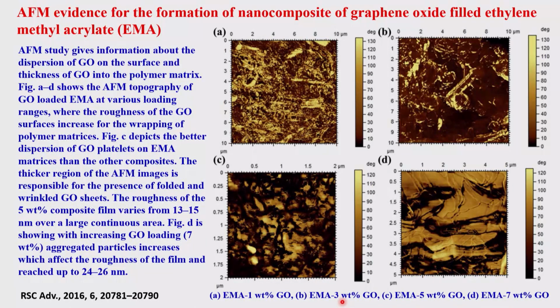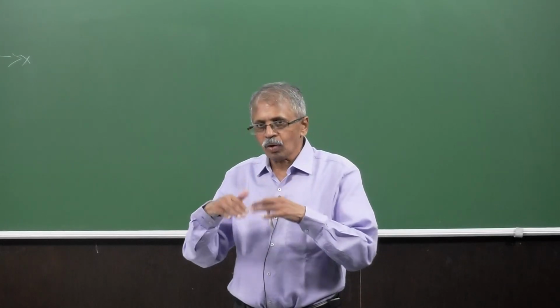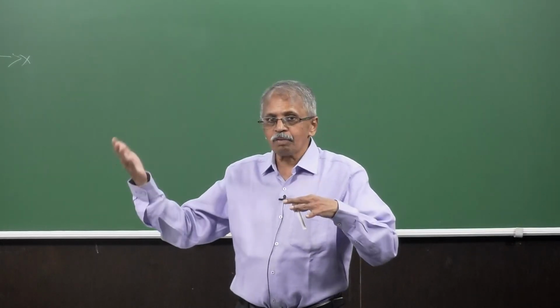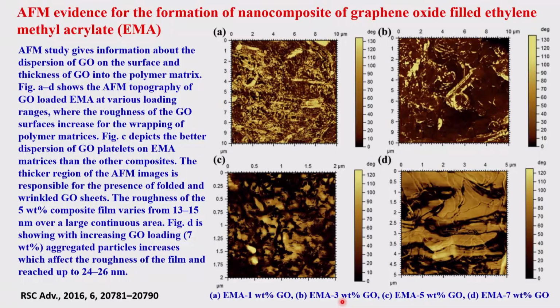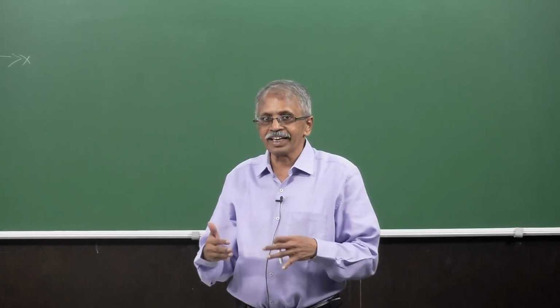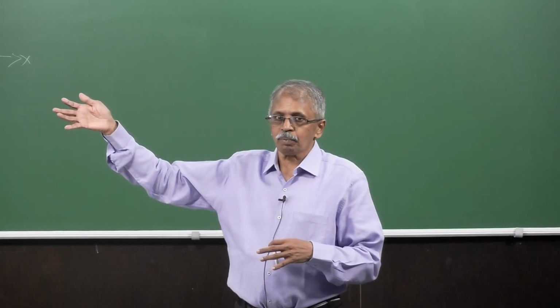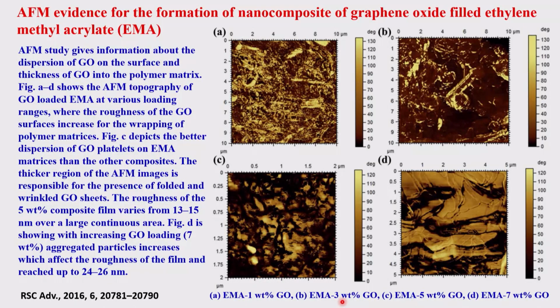Okay, to understand that we need to look at certain examples. So let us look at some examples of this. I'm going to cover these examples only up to the microscopy level, but the papers will have many other data as well. We will not be going into those aspects, because microscopy is used basically for characterization, for whatever we claim is there.